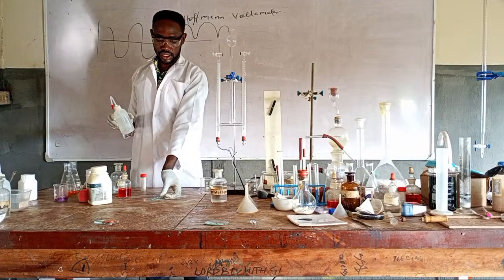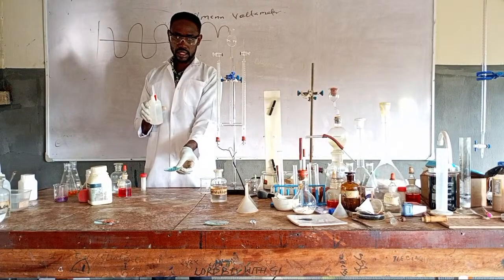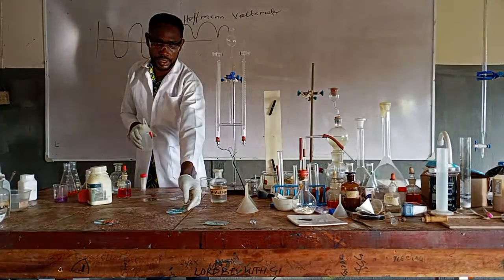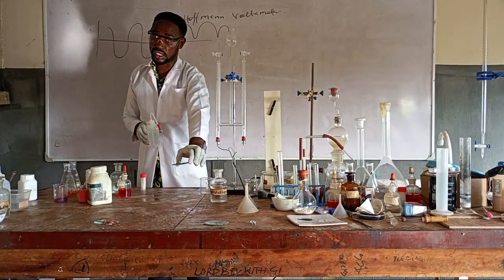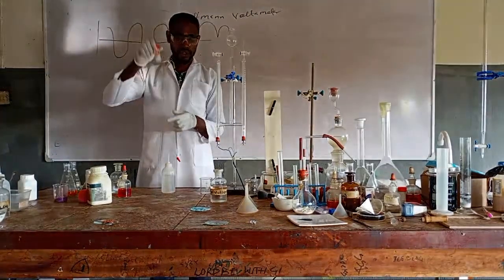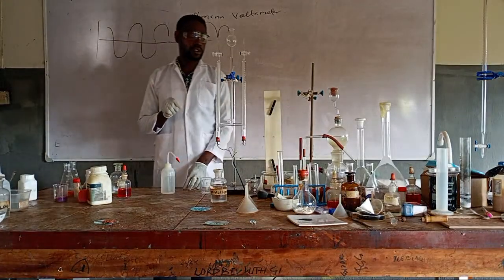If I add it to this place, it will turn what? And that's a positive test for water. Have you seen it? It has turned blue. So if I want it to come back to anhydrous, what happens? You heat it. But the hydration is exothermic. It releases a small amount of heat. Therefore, what is here is anhydrous. If I don't close it tightly, with time it will turn what? Blue.